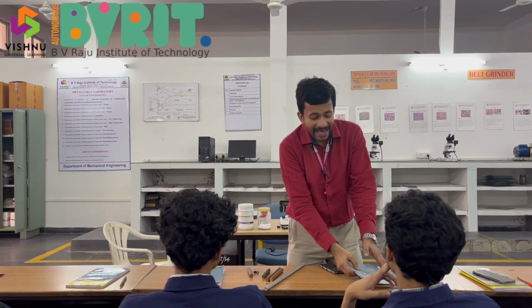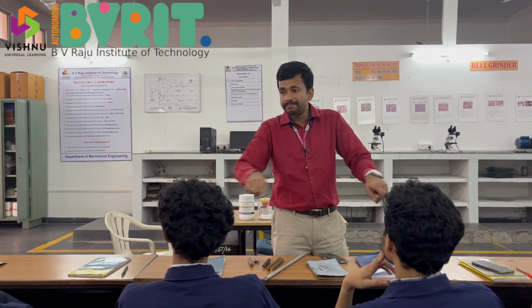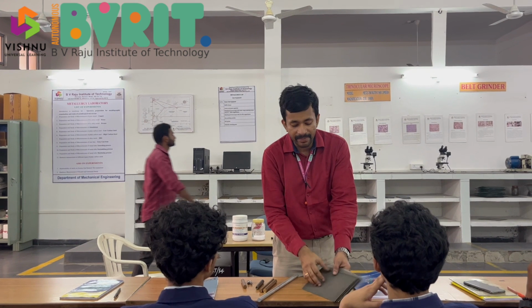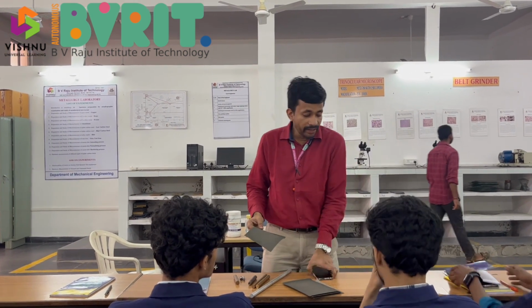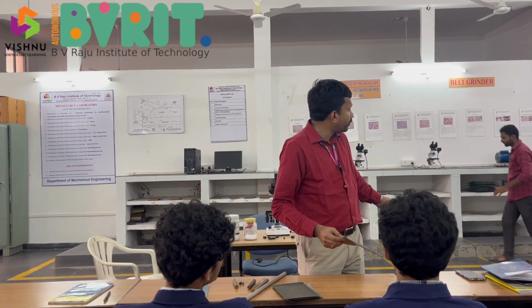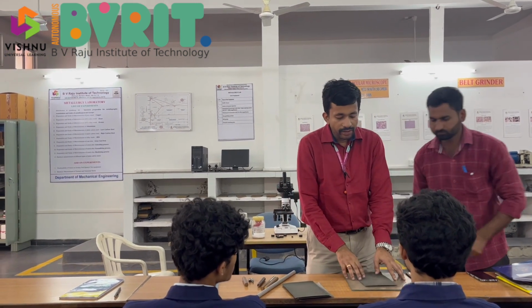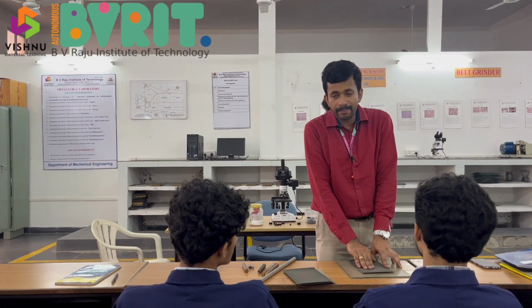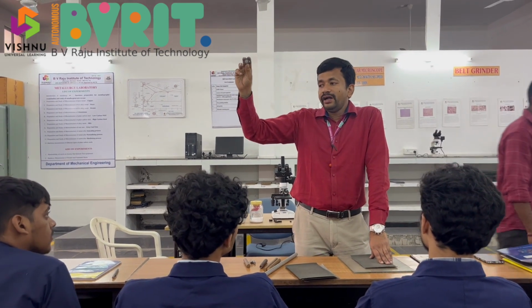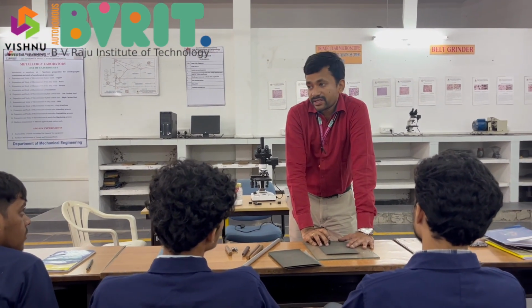So you have to stack all these emery papers, and then you will be given a glass plate. On top of the glass plate, you take this emery paper, okay, and then keep it on the glass plate, and then use this specimen. You need to position it in such a way that you operate only in one direction.